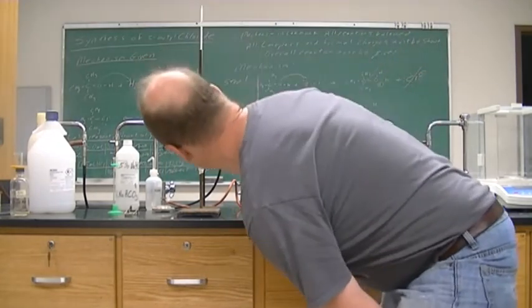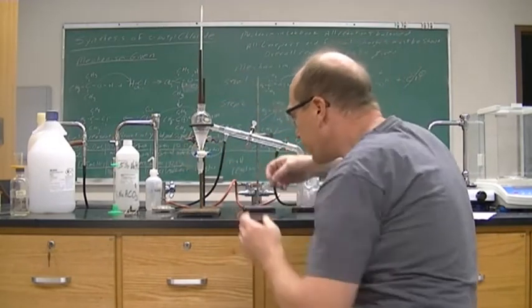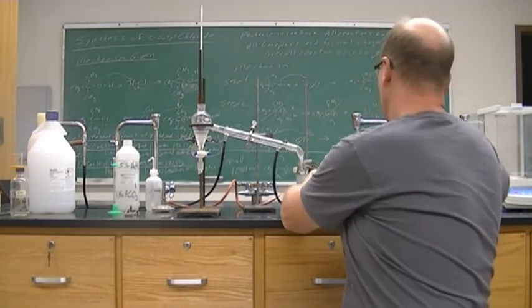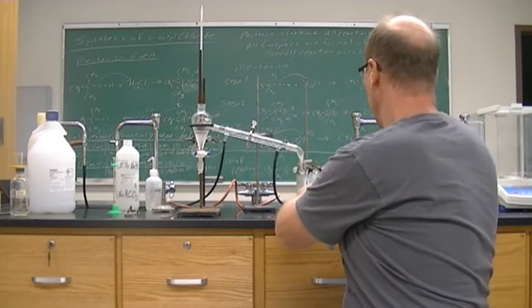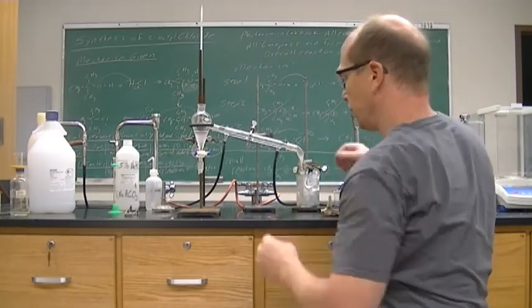All right, let's see how our separating is going. So again, we're only talking a few milliliters of product that we're going to get here.